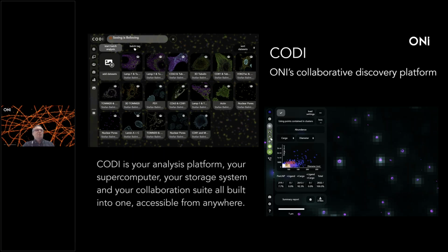With the second step, you can set some filtering parameters. Sometimes not everything is a single molecule, and you can have some small background. So this is the point when you can set this up. The third step is to identify what is a cluster. We have a cluster analysis algorithm, which is based on machine learning, but also on DBSCAN. You can use a surface marker to determine what is an individual LNP. And after determining what's an individual LNP and measuring the size, we go to the quantitative part of it.